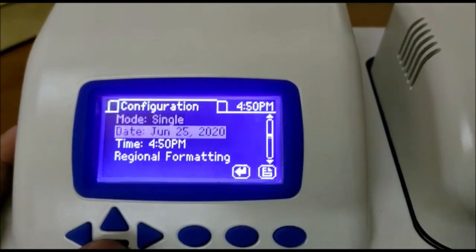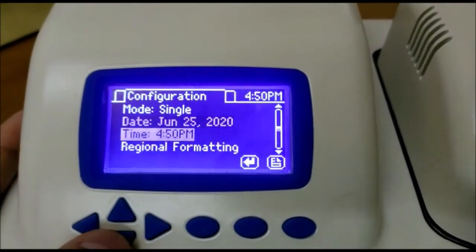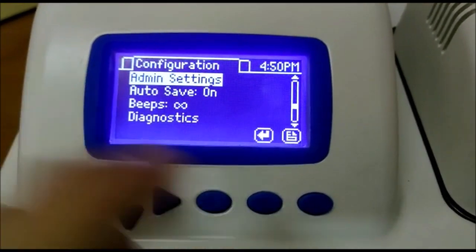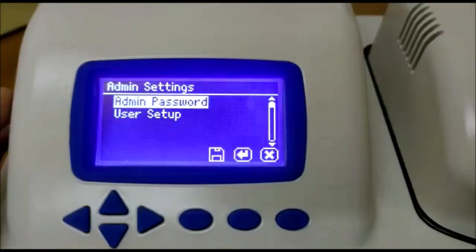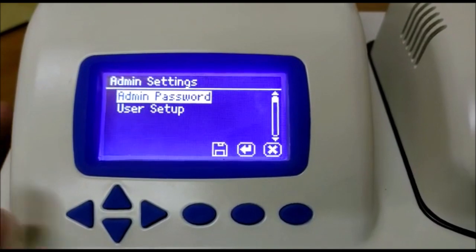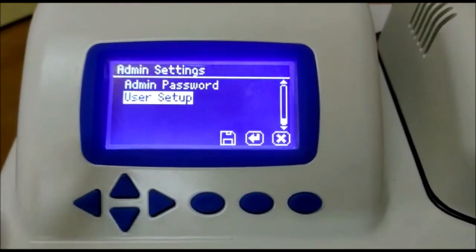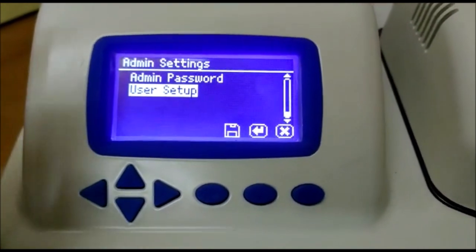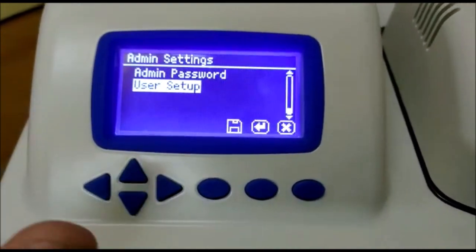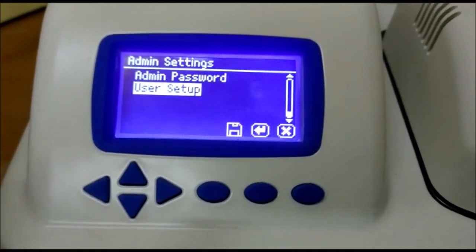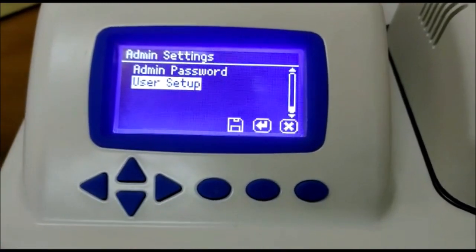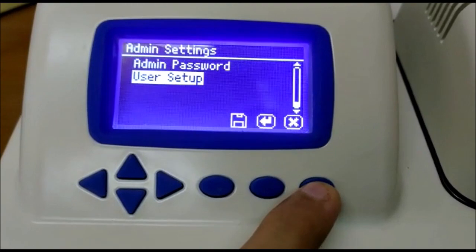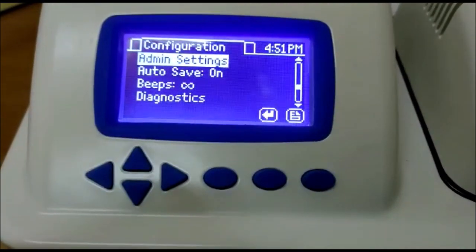Rest of the things are date. You can change date, time, regional formatting that includes languages. Admin settings. This is one of the important features. Here you can set a master admin password and that admin can make 25 users. And all the regulations of the users will be done by admin only. He can lock calibration or any other settings for the users. You can do that in admin mode.